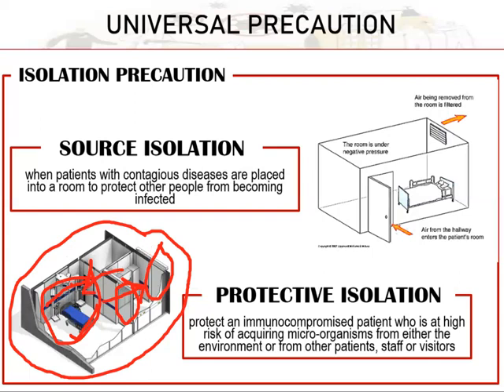And different ang ventilation, class, inside the isolation room. So, dili siya naka-aircon, dili po siya naka-electric fan. Kay if aircon, of course, maglibot-libot lang yun ang hangin sulod sa room, no? So, it needs to have this, naa siya yung negative pressure inside, and then, this, mura siya og kanang exhaust.